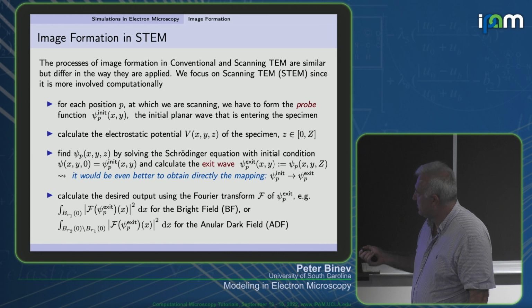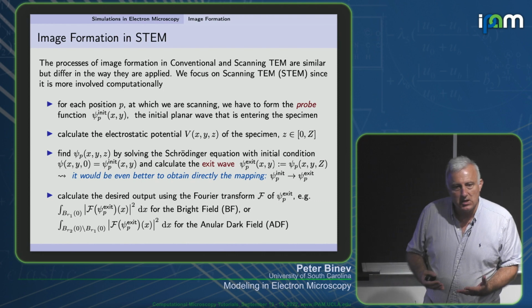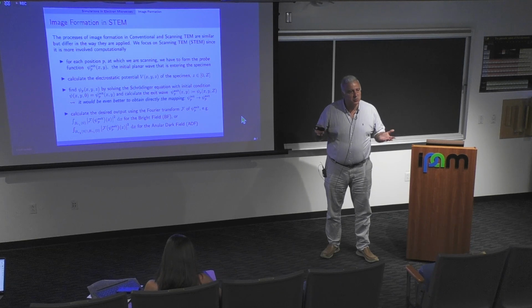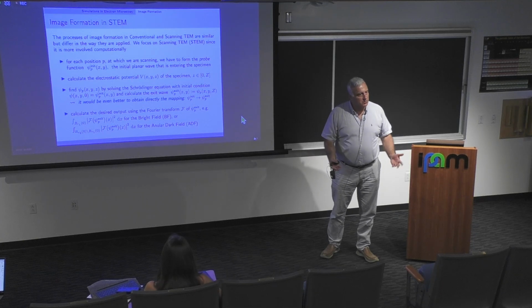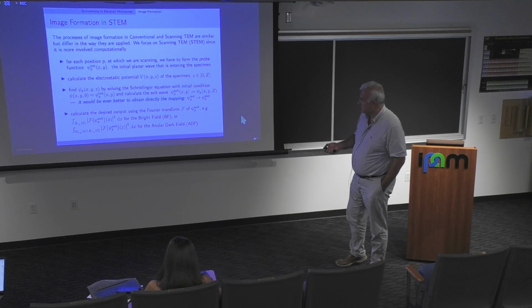The next point is, I want to say that for conventional electron microscopy, we can consider the same equation. Simply, we change completely what the initial wave is. The initial electron wave would then be spread around. And then, of course, we treat the exit wave in a completely different way to receive the results. So that is what is happening.